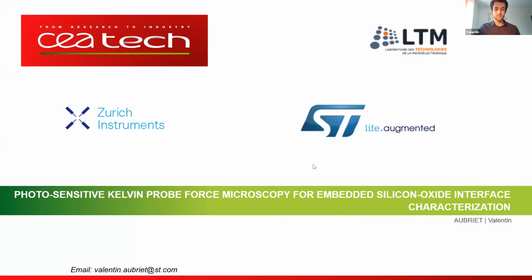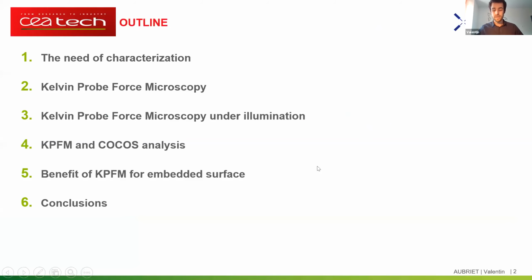Hello, good afternoon to everyone. My name is Valentin Aubriet, and I am a second year PhD student at ST Microelectronics. Today I will talk about the development of advanced atomic force microscopy for photosensitive applications. I will start this talk by presenting the context and the state of the art of the techniques. Then I will talk about the Kelvin probe force microscopy, and then I will finish by presenting the results.